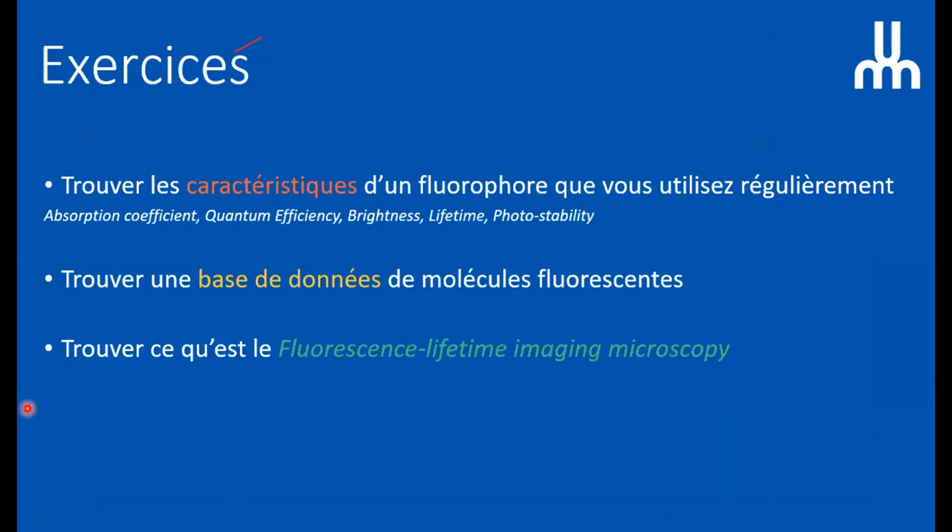And the last question I wanted you to do in the exercise is to look at fluorescent lifetime imaging. So when a molecule is excited, it's going to decay. And this decay is very particular to the compound you are using. You can actually use this decay to fingerprint which molecule is there. So instead of looking at the brightness, you're going to look at the brightness over very, very short time scales, nanoseconds, things that are very short. And this decay is going to tell you, oh, it's a GFP molecule, or it's a tdTomato molecule, or it's a FITC molecule. And it's very specific to them.